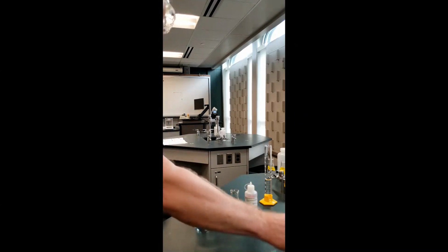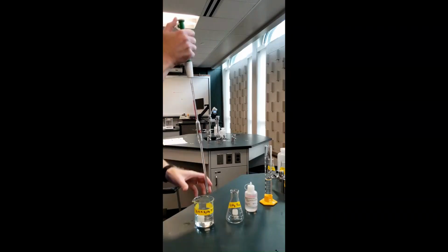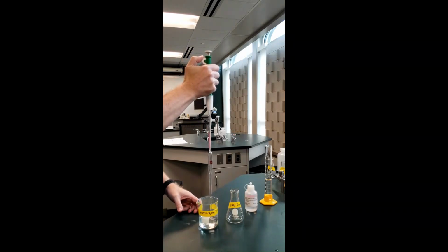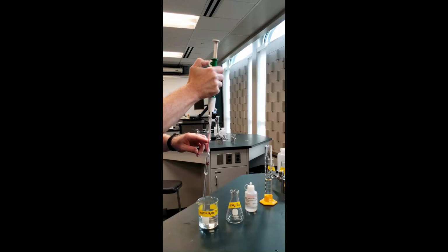So let's do this. I have the 10 ml volumetric pipette and the pipette filler, and this is our sulfuric acid solution that should be about 0.15 molar. I'm going to draw up 10 mils, and the line is above the bulb, if you remember from experiment 1. And because I'm so old, oh, there it is. Okay, I see it. It's very faint. And this one, it's not even painted on; it's etched in. And there we go. I see it.